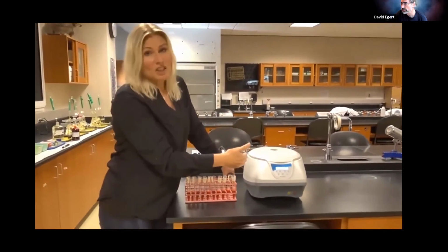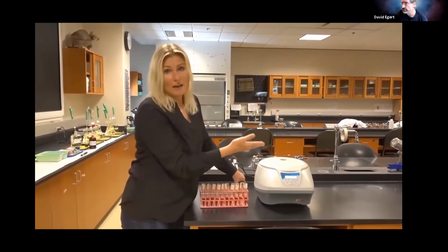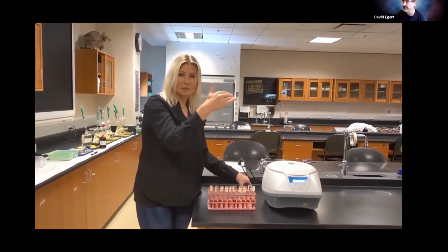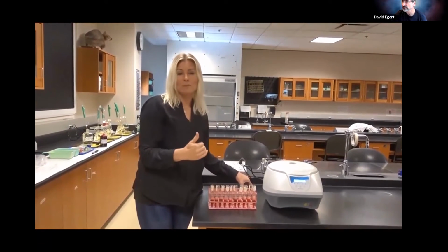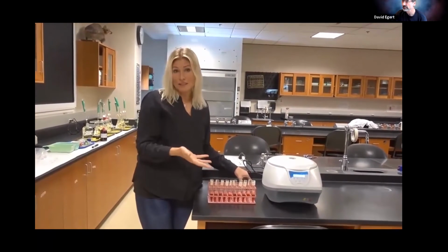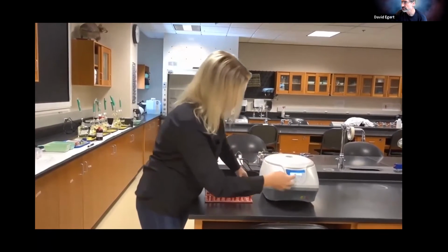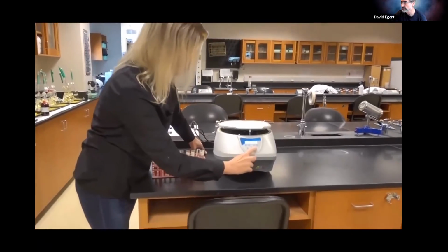So we're going to get a lot of G's, and it's going to separate out the components of this fluid based on density. We'll get the denser particles at the bottom, so our red blood cells will be down there forming a pellet, hopefully. All right, so next we're going to press open.